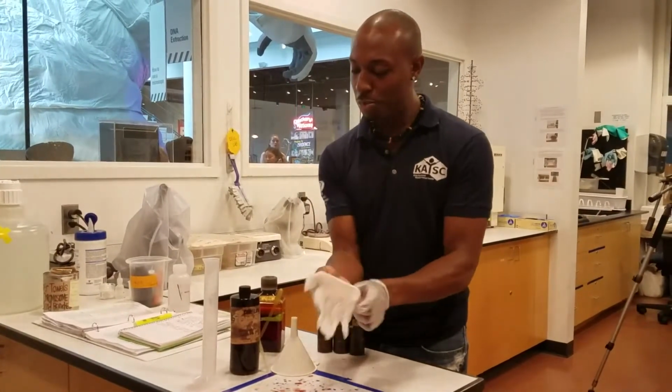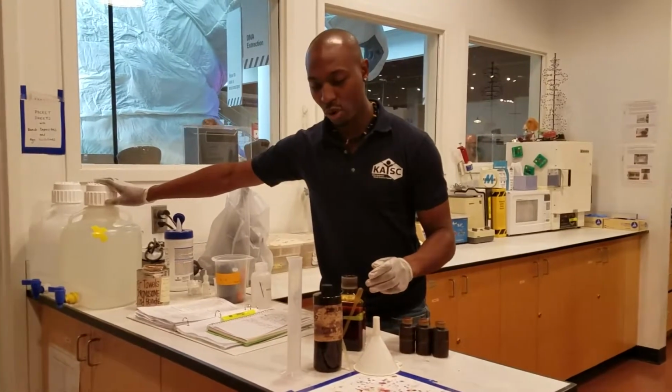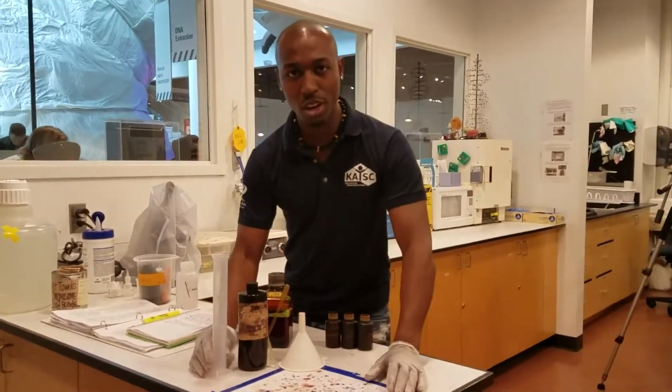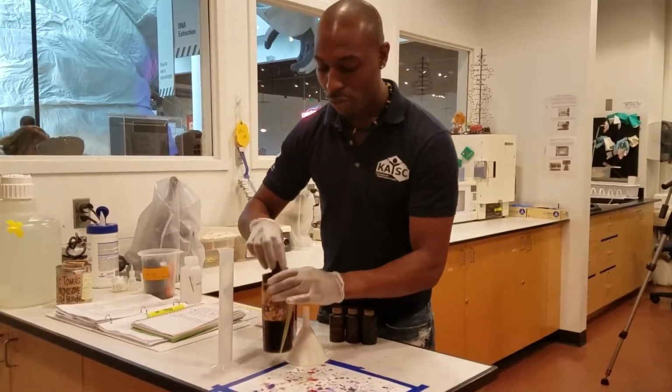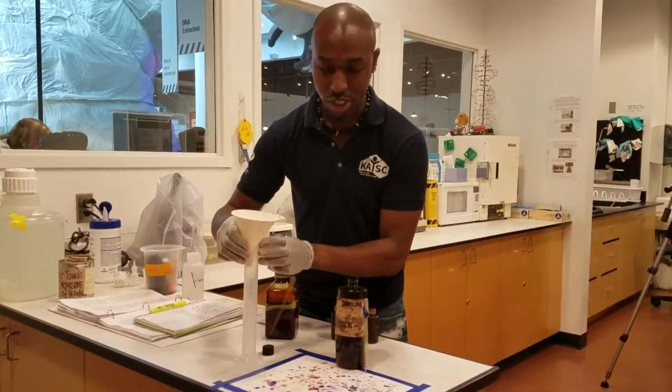Now, with this experiment, we also need our distilled water over here in the corner, but we're not going to worry about that. We're going to worry about placing 10% of our Lugols solution, okay? Now, how do we do that? Well, first we got to open the Lugols solution, place our funnel into our cylinder.